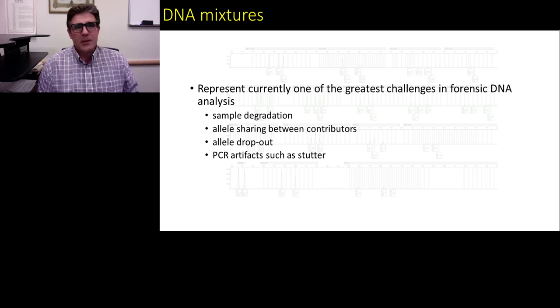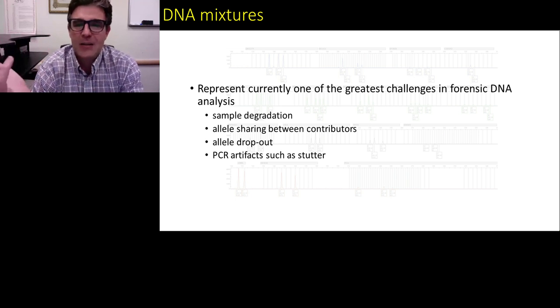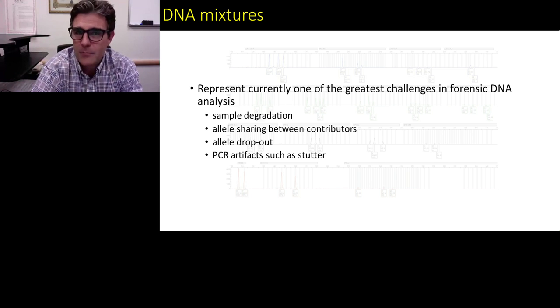So mixtures, DNA mixtures, probably represent one of the greatest challenges in forensic DNA analysis. There are many reasons for that. Sample degradation can affect the quality of the mixture, and there are allele sharing between contributors, allele dropout, and PCR artifacts such as stutter. And this is obviously with the conventional DNA markers used in our field, which are short tandem repeats.